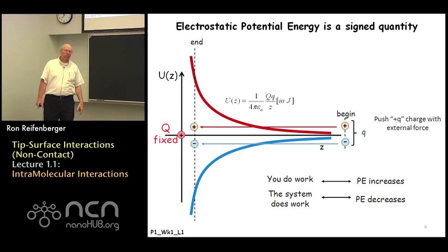Conversely, if the polarity of the two charges is opposite, then the interaction potential energy will decrease, and we'll follow the blue curve indicated in this diagram. The interaction potential energy becomes negative, and that indicates that the final configuration of charges is in a lower potential energy state than it was at the beginning of the calculation when the two charges were far apart.